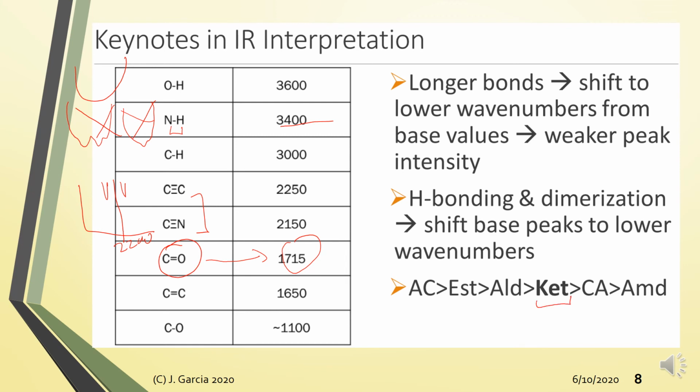Okay, now if your carbonyl is an aldehyde, or part of an aldehyde, expect that the carbonyl peak, no, the strong sharp peak, will appear at a higher wave number value. But if you have an amide, alright, then the carbonyl will be found at a lower wave number value, so around 1600s na, no, ganun kababa.